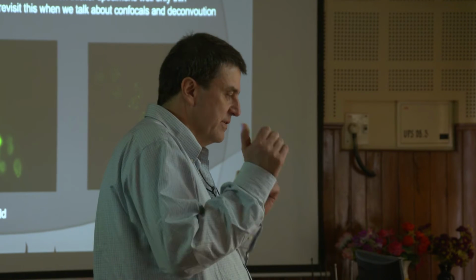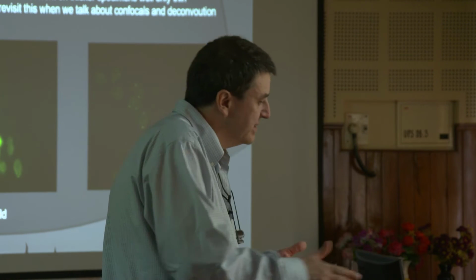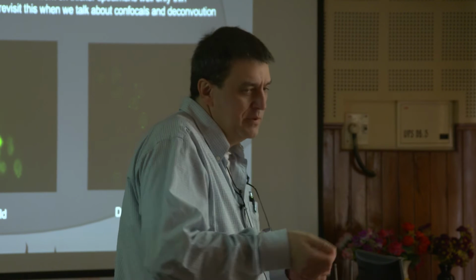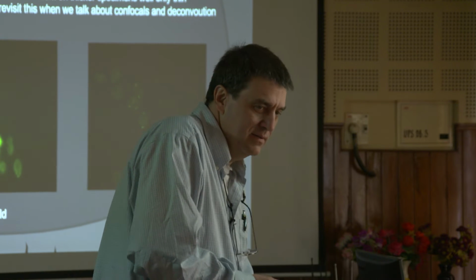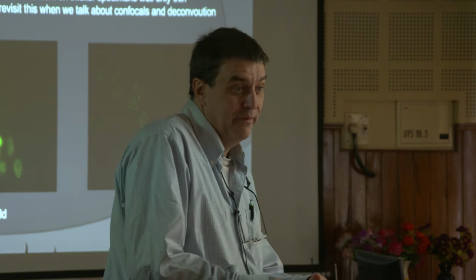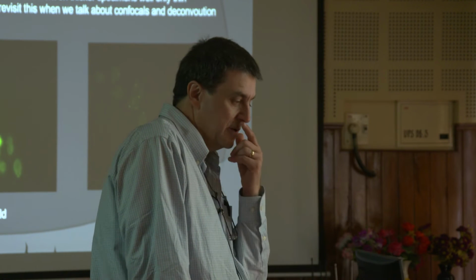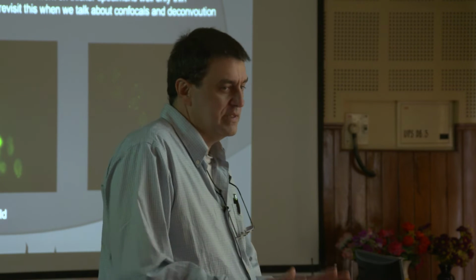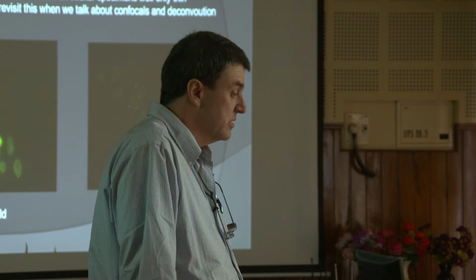And Alexa, again, is a very good dye. It will not bleach, but there's even some extra chemistry on those. I had the same thing when I was a rep; I carried that in my pocket. Because you want to use this absolutely gorgeous slide to try to sell the microscope. You don't want to pull out some horrible sample and go, oh, look at this. You want to pull out something super awesome. I think the slide I had like that was a $300 slide for one slide. I don't know if you have the same one, but it's special, and it won't bleach, whatever the chemistry is. But I had mine for like 3 years. Yeah.